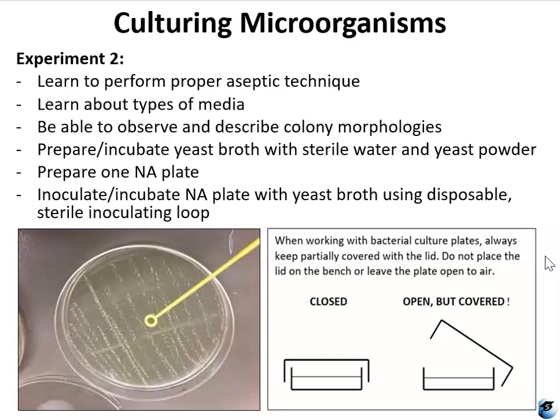For experiment 2, we're going to be learning how to perform proper aseptic technique while working with different types of media, and also again being able to observe colony morphologies. And you're going to be working with a Saccharomyces yeast. You're going to want to set this lab up ahead of time because you first have to culture the yeast in a broth, and then you're going to transfer it from a broth to a plate and culture it again. And that's going to take about 3 days altogether. So you want to set this up ahead of time.